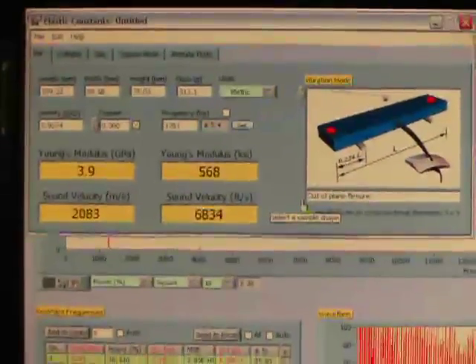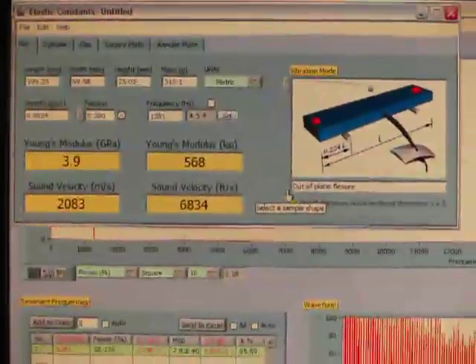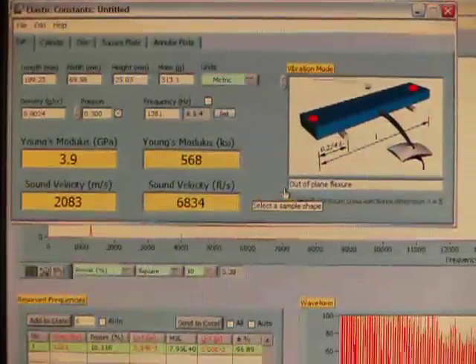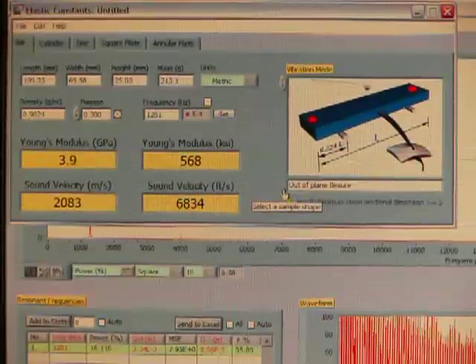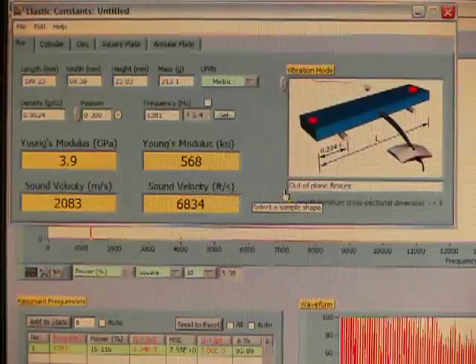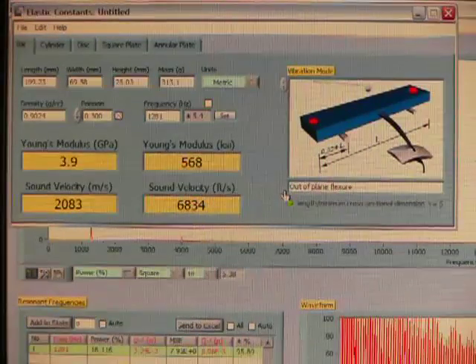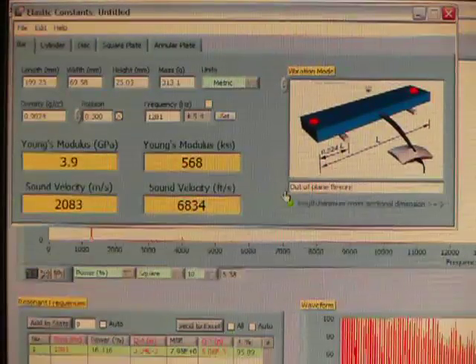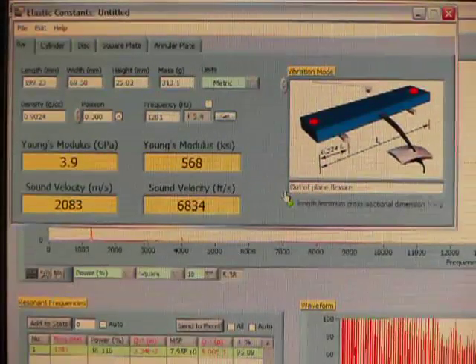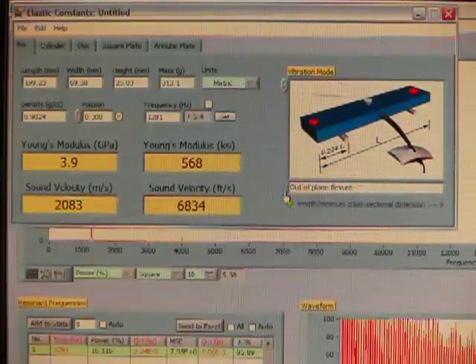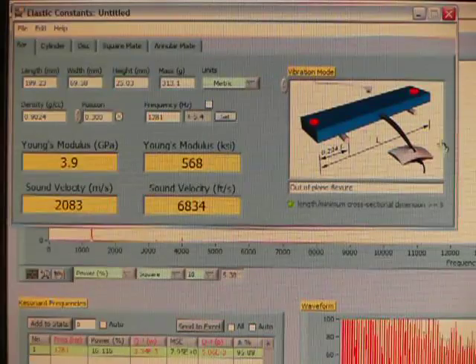So in this case I selected a Poisson's ratio and you can see there we've got a Young's modulus of 3.9 gigapascals or 568 kilopsi. And that's all there is to it.